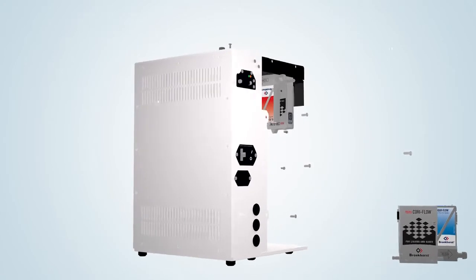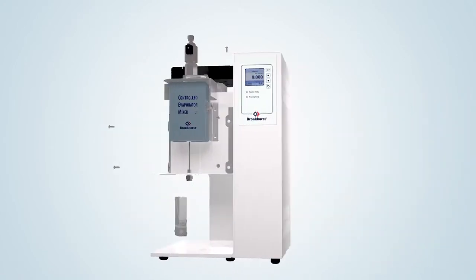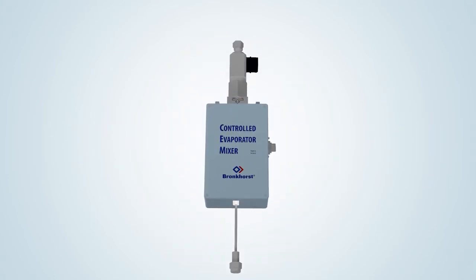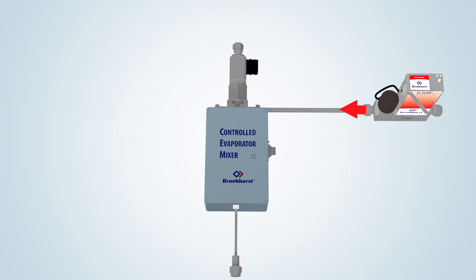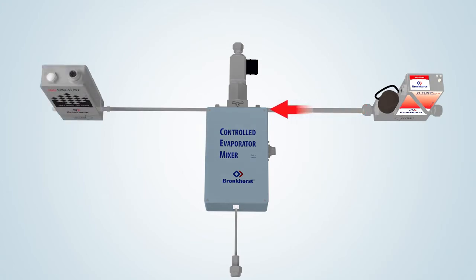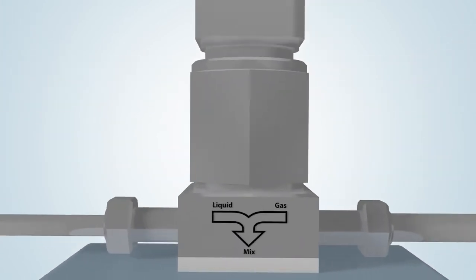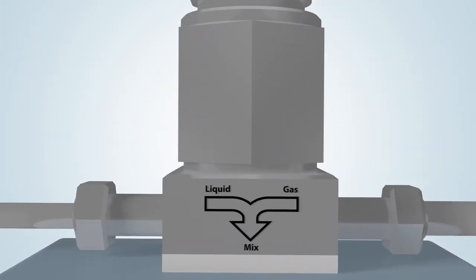The unique Bronkhorst temperature controlled mixing and evaporation device forms the heart of the vapor delivery module. The gas flow controller provides an accurately controlled carrier gas flow. The liquid, drawn from, for example, a pressurized container, is measured by the liquid flow meter and led into the mixing valve.